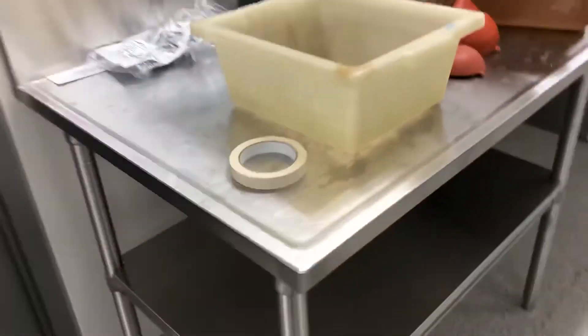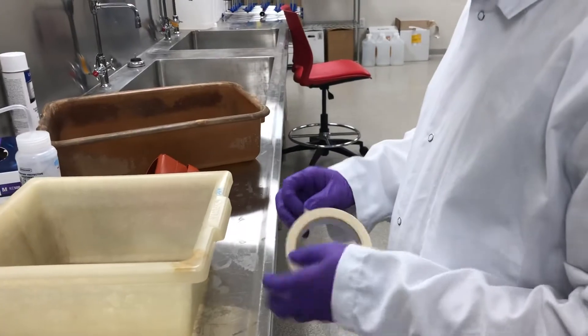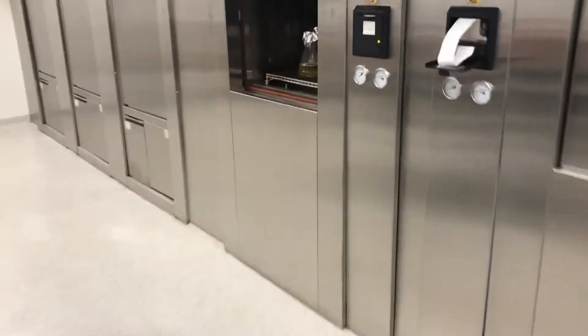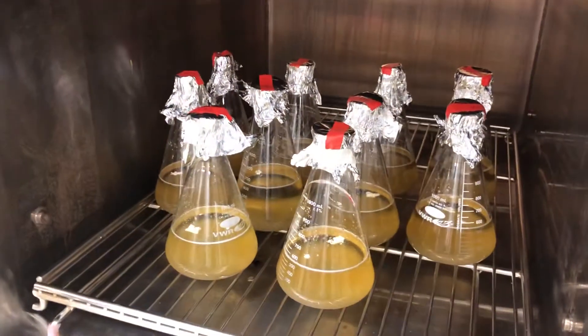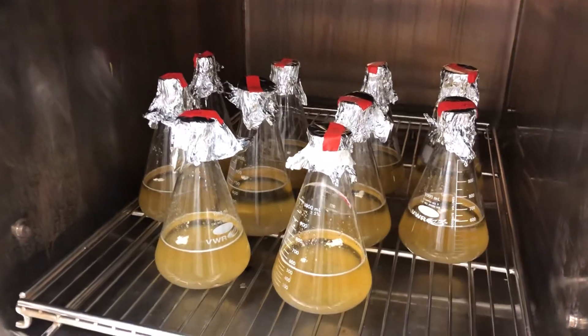It's helpful if you put a piece of autoclave tape — you only need one piece that goes on one of the flasks. Just like with the labeling, put this indicator tape on one of the foil wrappers so we can remove it easily. That'll tell us whether the autoclave actually worked, because it'll turn brown stripes.